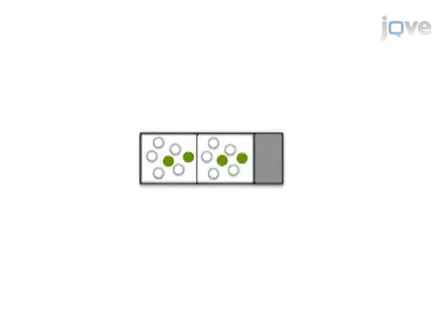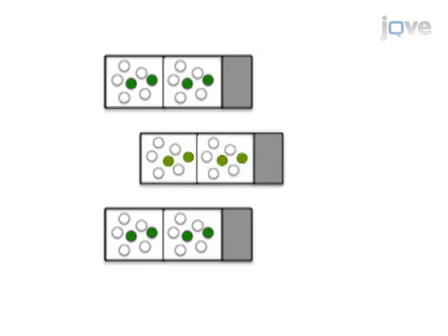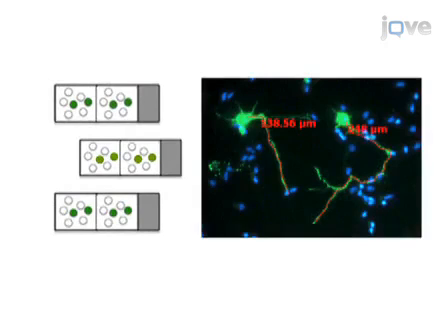Next, these cells are dissociated and plated in chamber slides and cultured in order to examine the effects of both intrinsic genetic alteration and application of exogenous factors. Results are obtained that show effects on neurite outgrowth and branching based on quantitative measurements using AxioVision software.